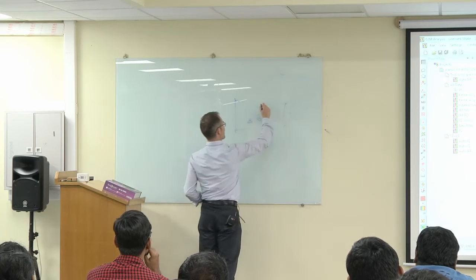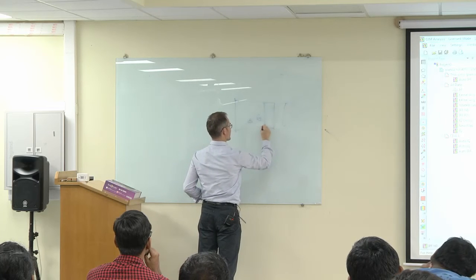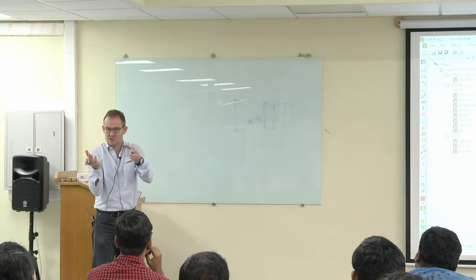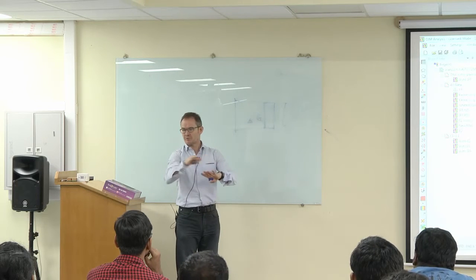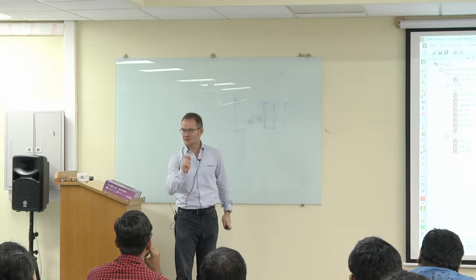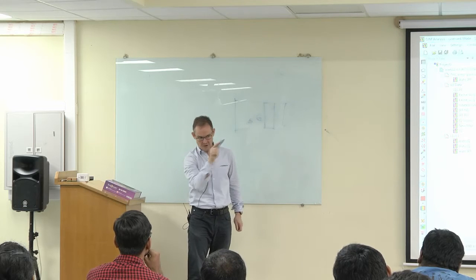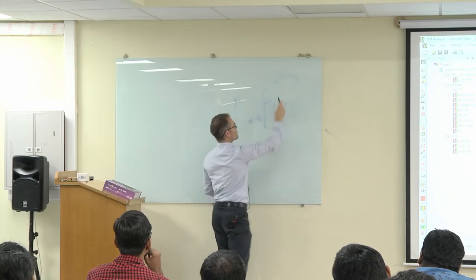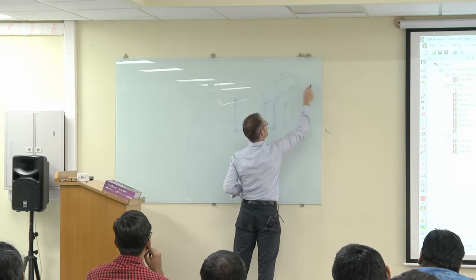Let's just assume it was on this side here. And we measured an area, something like that here. Yeah, so this was our measurement area. Why do I select a cross section and not, it would be much simpler, it was a thin sheet, would be much simpler to look on that sample surface here, yeah? Then you just polish the sheet, you don't need to have a cross section, you don't need to mount it properly, everything easier. But if you look on that surface here, you will see something very special when you have this rolled material. You will see grains which have no clear borders, and sometimes you have another grain coming up, and then another grain coming up again.